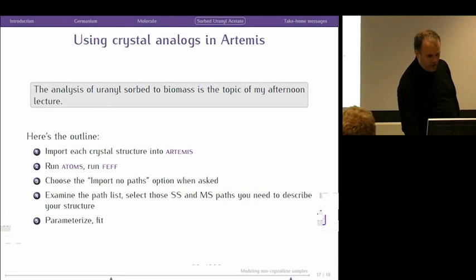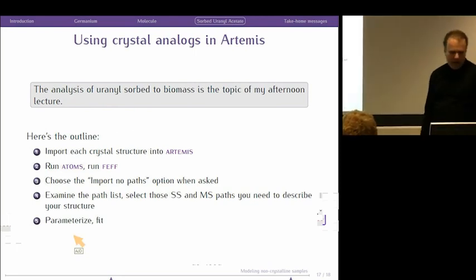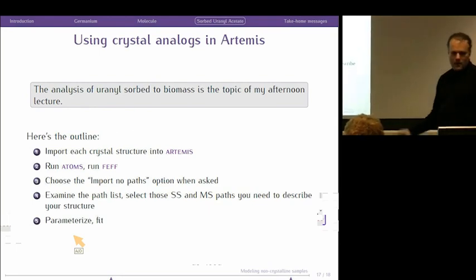So how is this done in Artemis? Well, import each crystal structure into Artemis. Convert the crystal structure into the Feff input file, run Feff.